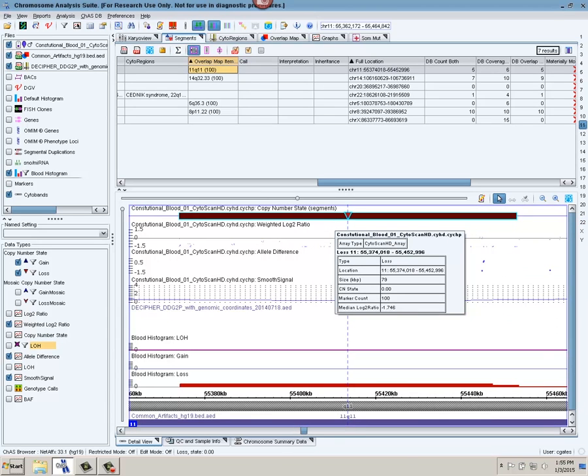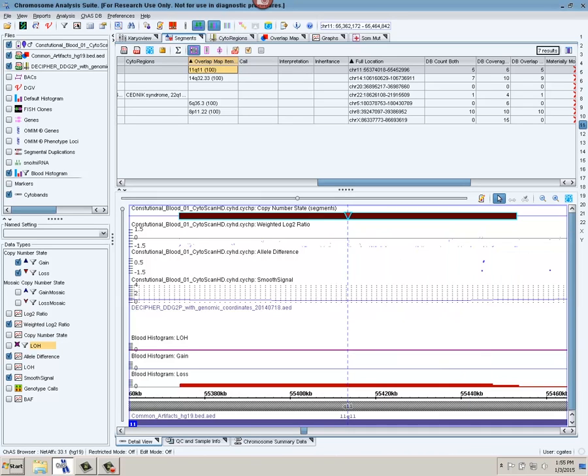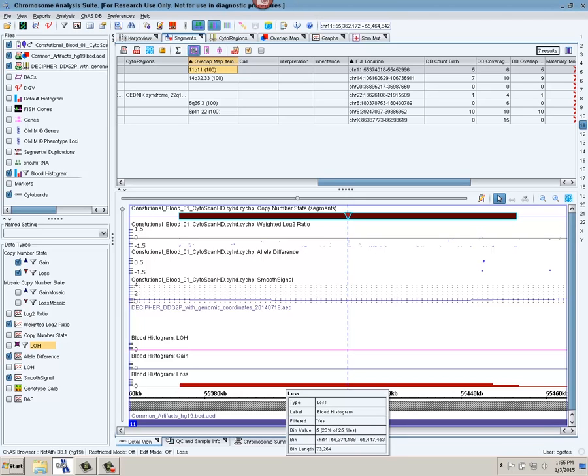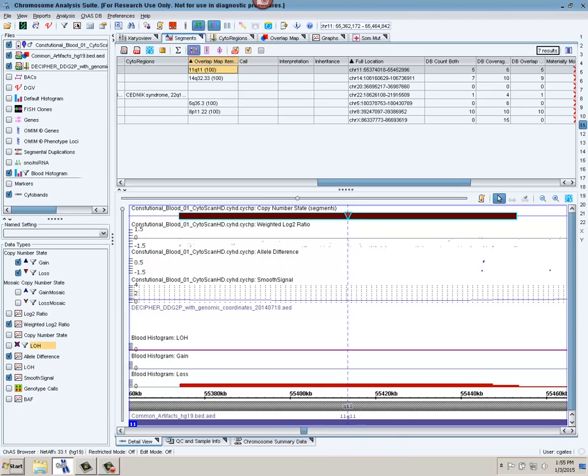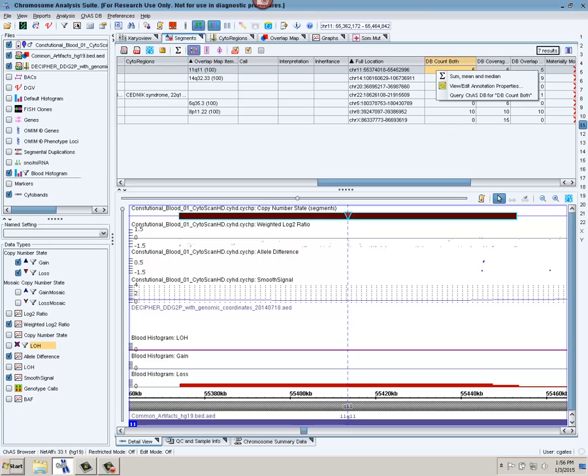So let's go ahead and we'll click on the first row. That jumps me to this particular segment here. I can see I have a loss. Below I'm showing histograms for all the blood samples in my database and which segments have been shown to have gains or losses. So in this case I have seen something in this region before. It does overlap with my overlap map.